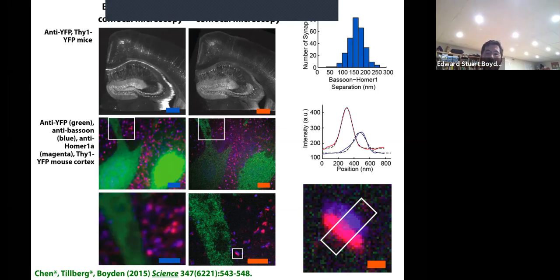Furthermore, if you look at the gap between these two protein densities, you get the same answer that Catherine Dulac and Xiaowei Zhuang measured many years ago with STORM microscopy, a classical super-resolution method that Xiaowei invented. But now, you can take these images on regular existing microscopes.